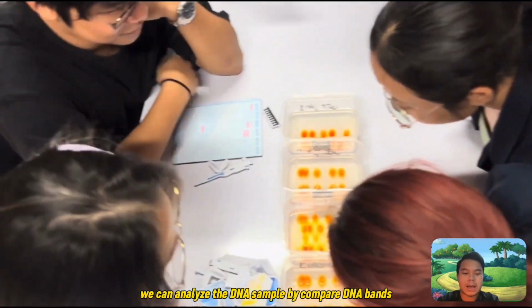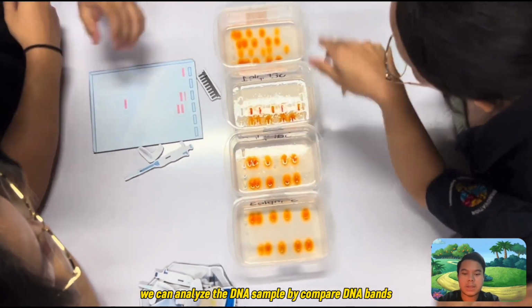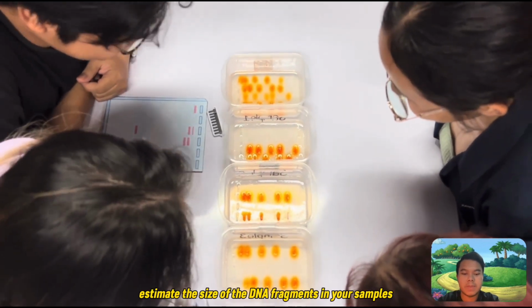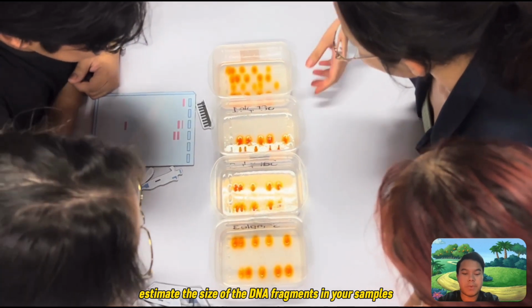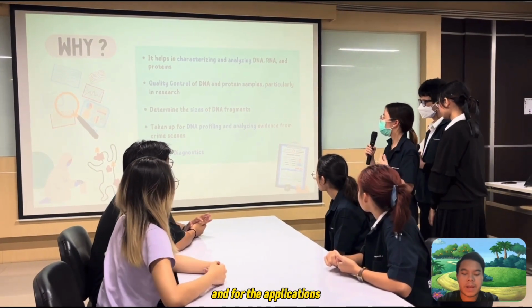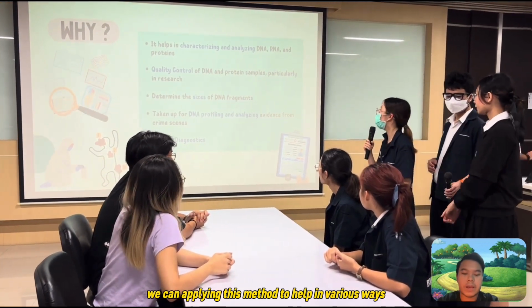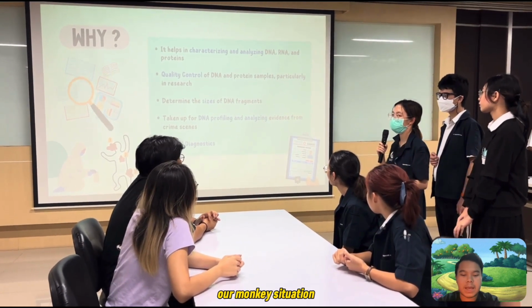We can analyze the DNA sample by comparing DNA bands to the DNA marker to help estimate the size of the DNA fragments in your samples. And for the applications, we can apply this method to help in various ways, for example, our monkey situation.